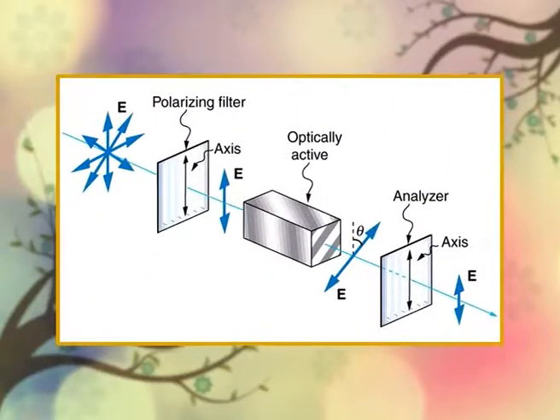The optical rotation of a mixed component ingredient, intermediate or finished product will have a characteristic optical rotation that may arise from the presence of several chiral compounds. Once a standard is determined for the composite observed rotation, one can establish quality criteria based on optical rotation. In these situations, the polarimeter measurement becomes a type of screen for further testing to determine which ingredient is out of the specification.